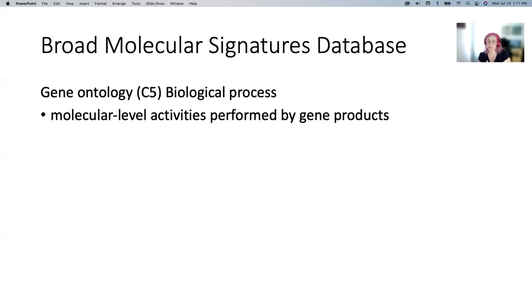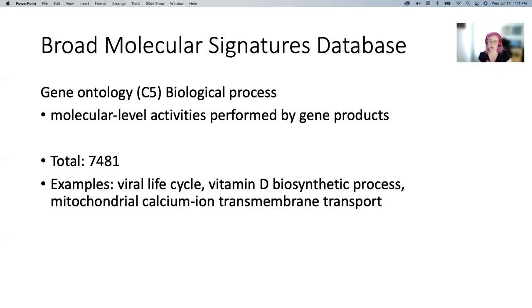The next one we like to use is Gene Ontology — these are GO terms. GO terms have a lot of different sections. We like the biological process section because it's action-oriented. There's also cellular component, which is more about where does it localize in the cell. We're more interested in activities by gene products — what is an enzyme doing. This is the largest of the ones I'll show, at almost 7,500 gene sets. Things range in how specific they are: from viral life cycle, which is general, to vitamin D biosynthetic process, to something as specific as mitochondrial calcium transport.